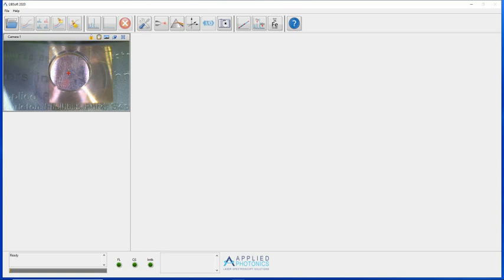So if we configure the acquisition, firstly the acquisition configuration parameters, we will set 50 conditioning shots, 50 accumulation shots, 1 spectrum, and just 1 measurement. And we've got a sample of copper, so we'll call this copper. And we've already set a folder for the acquired spectra.